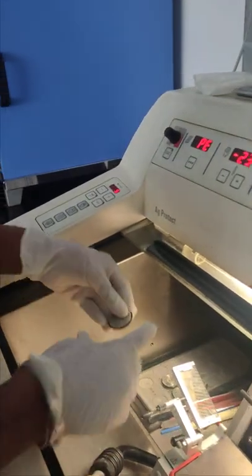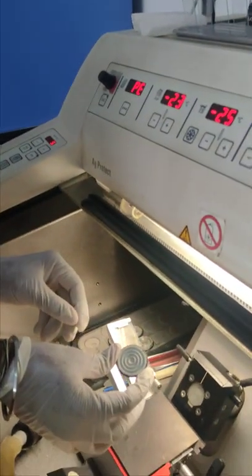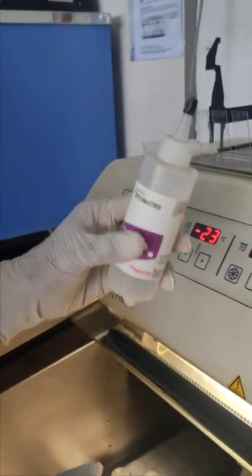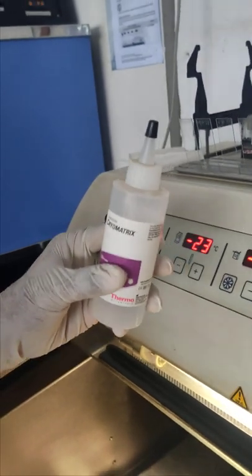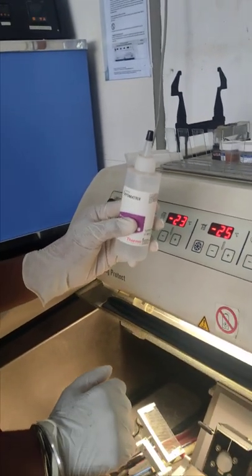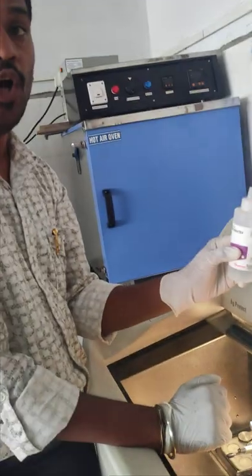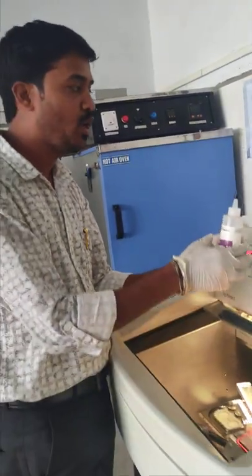To place tissue, we use what we call a chuck holder or metallic holder. The gel we use for making the frozen block is called cryomatrix gel, also known as OCT solution, which stands for optimum temperature control solution.